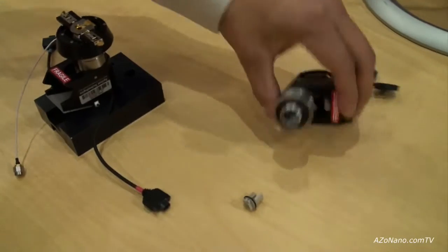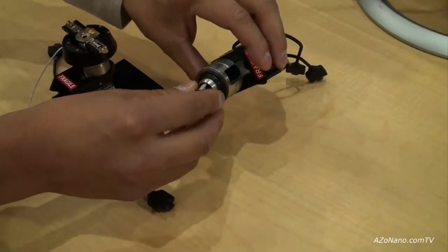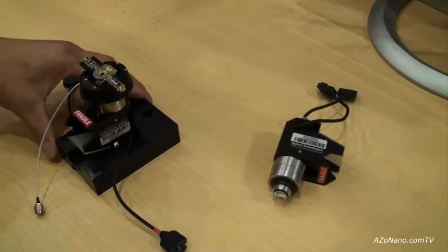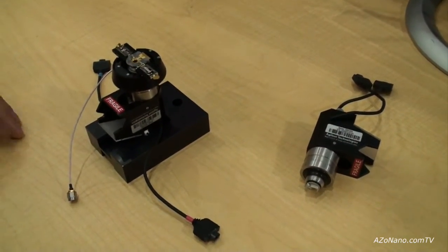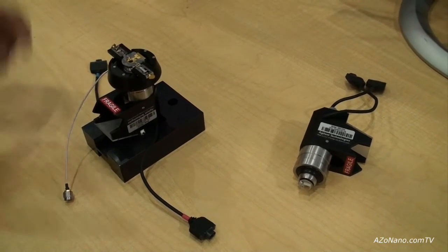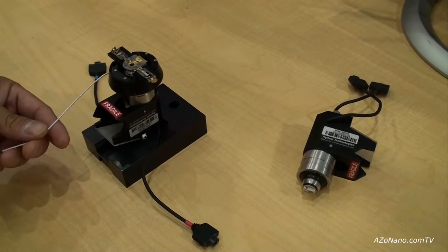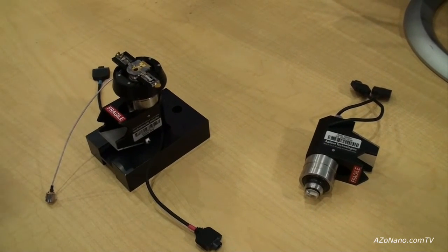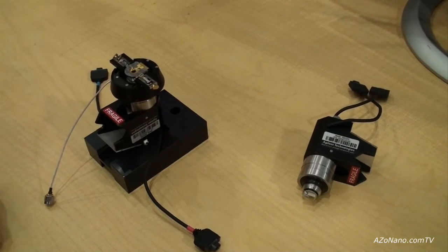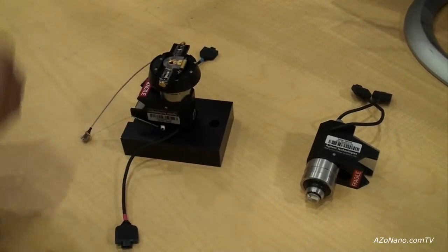The scanner design is modular, with different nose cones for different imaging techniques that simply insert into the end of the scanner. Within the SMM nose cone there is complex micromachining. What they're doing is taking a gigahertz RF signal and passing it through a coaxial cable all the way to the end of a cantilever AFM probe. The assembly houses cable routing and proper shielding to reduce parasitic currents surrounding the probe.